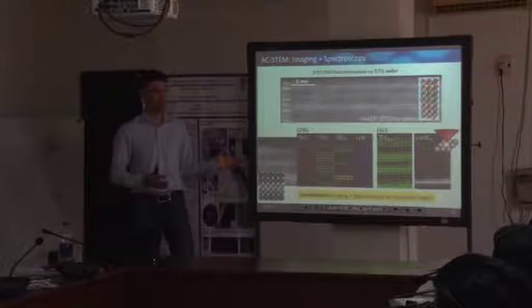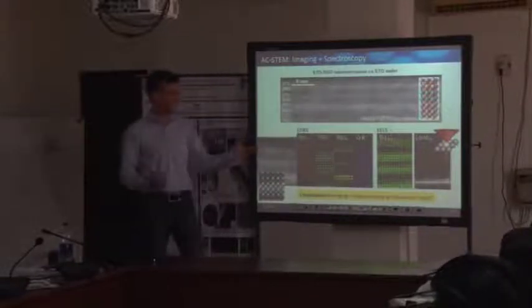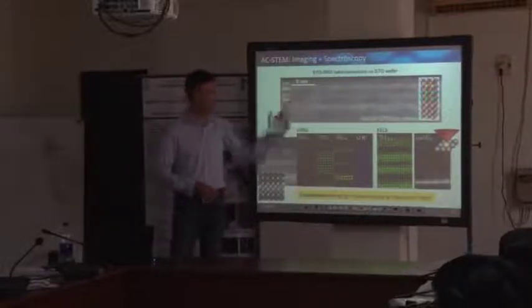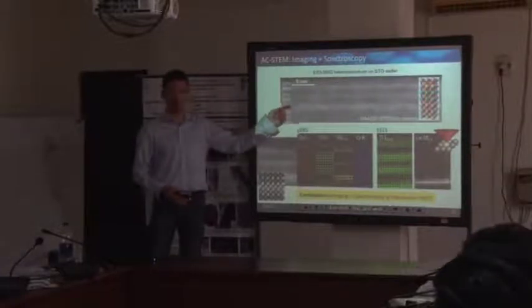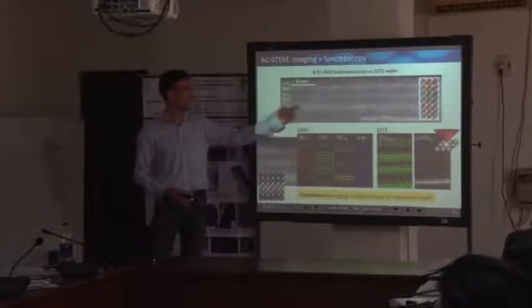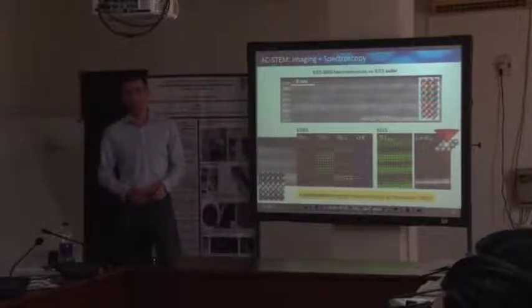So the data acquisition is not that much of a big deal anymore nowadays. Now we have to spend far more time, as we have done over the last tens of years, on the data evaluation. So first of all, you have to design your experiment well. You have to really think about what you want to do. The data acquisition is not that much of a big deal anymore. It's probably more about the sample preparation. This is the example that I showed you about this ion milling, where we faced these issues with the damaging of these strontium ruthenium layers, and it's more about having really clean and perfect TEM samples. So this is more like what we have to do.